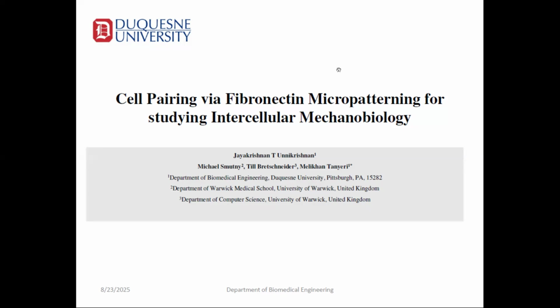Today, I'll present our work on developing a robust microcontact printing platform for high-precision cellular patterning.